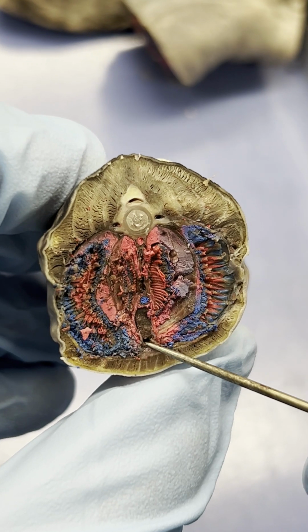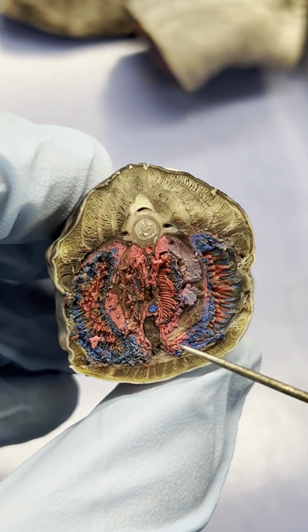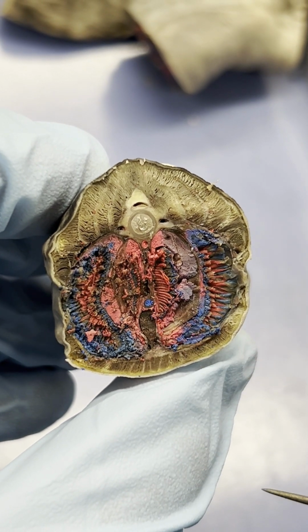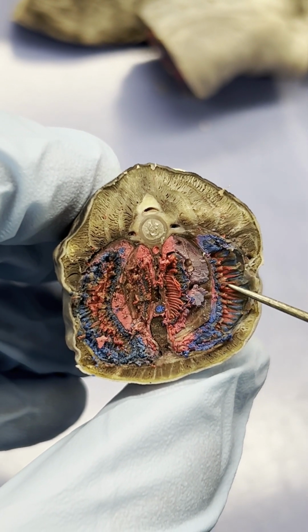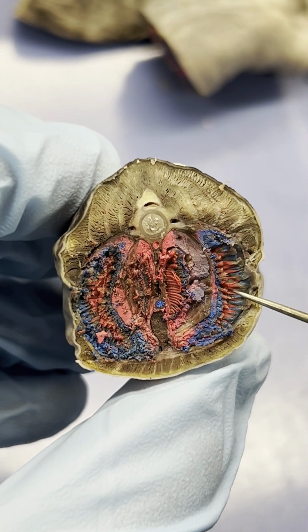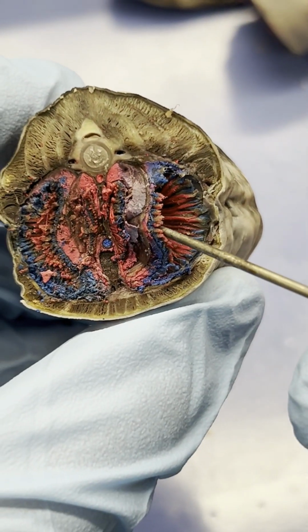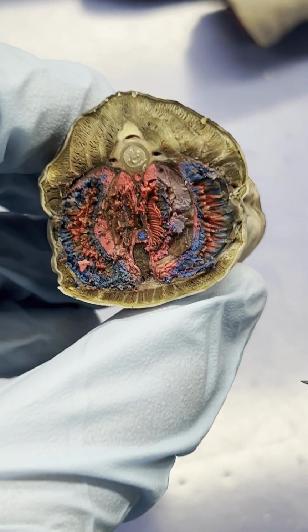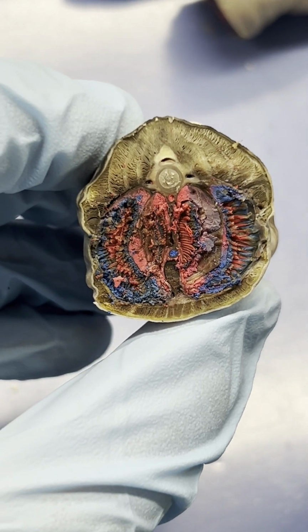There's going to be an opening right here, again, inferior jugular vein. The lingual muscle is right here. We have gill filaments on the left side and also the right side, and I find the gill pouches really cool, so you can kind of open that up a little bit. And that's it for figure 3.6B, branchial slit.